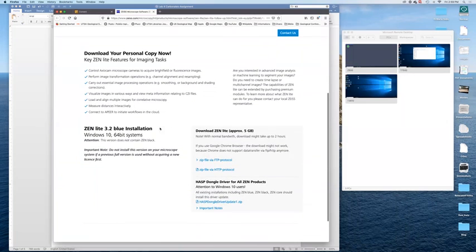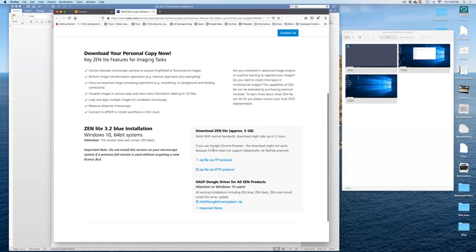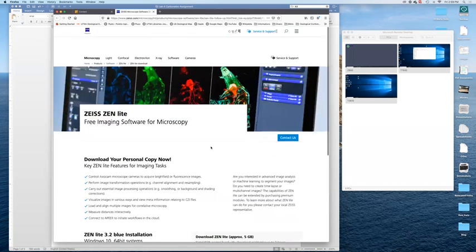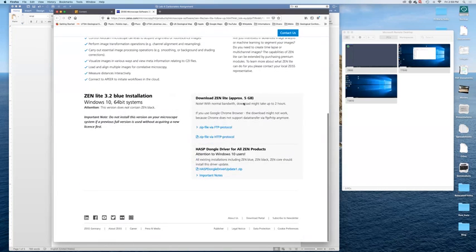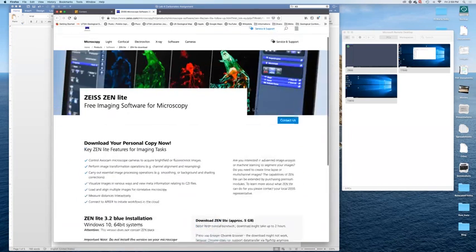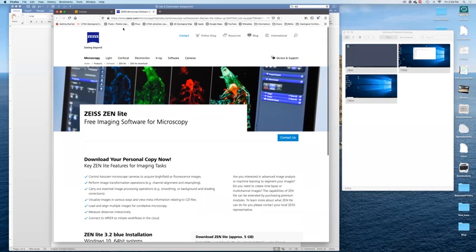If you scroll down, you have different ways that you can use to download and install that software. It's a pretty large piece of software, five gig. So that's the first step to take.